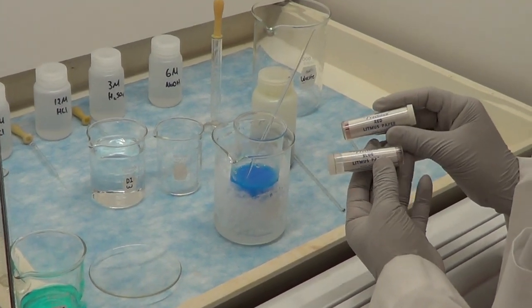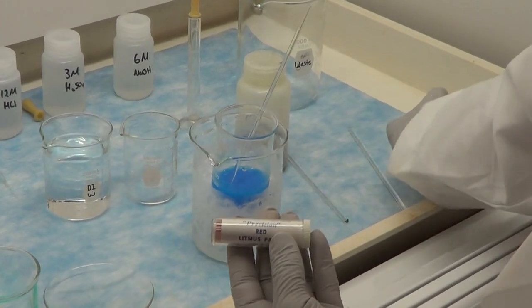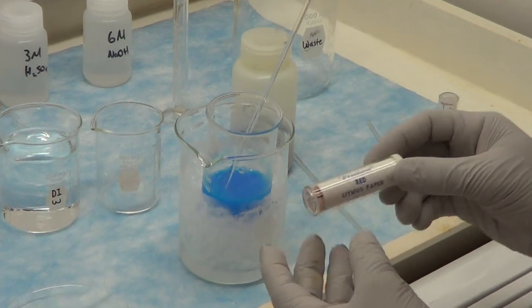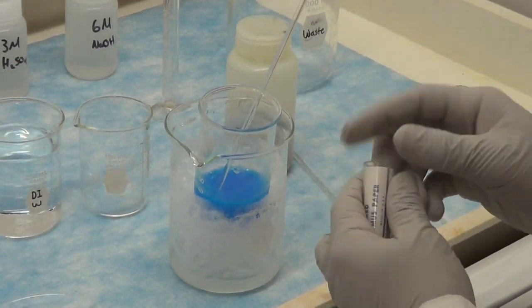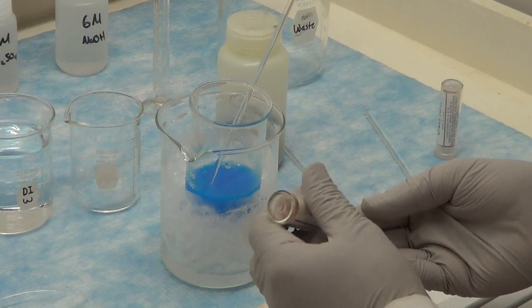We will then use the litmus paper to check the basicity of the supernatant liquid. We will take a strip of red litmus paper and place it on a watch glass.